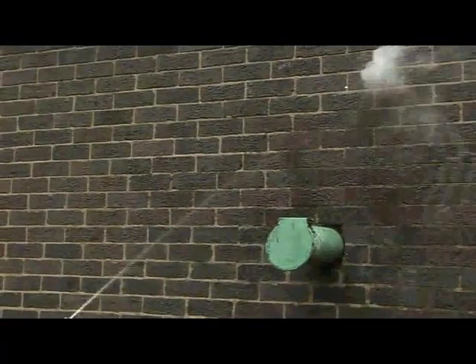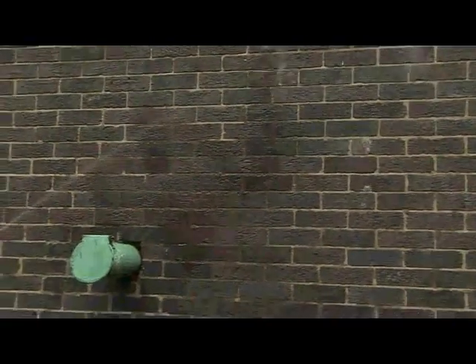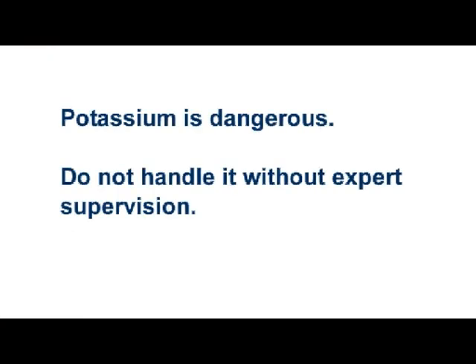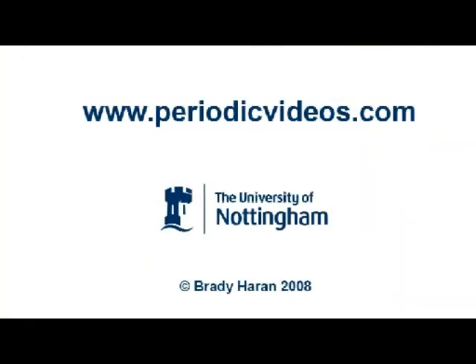As Neil quite literally wets the wall to get rid of all of that unreacted potassium. One of my colleagues who used to work with it described it as evil.